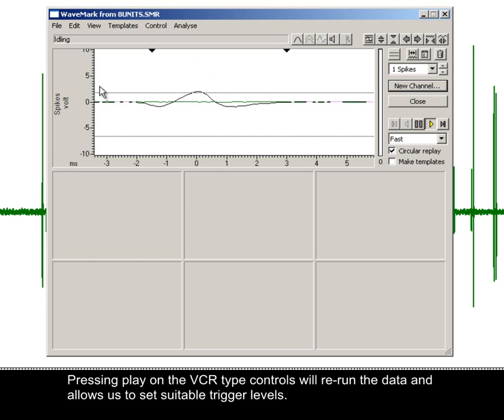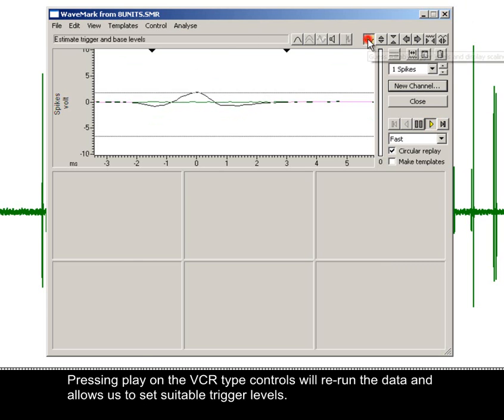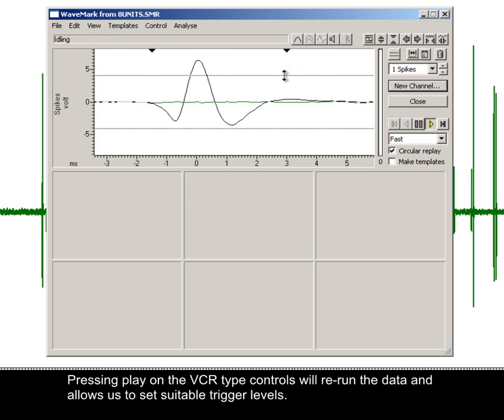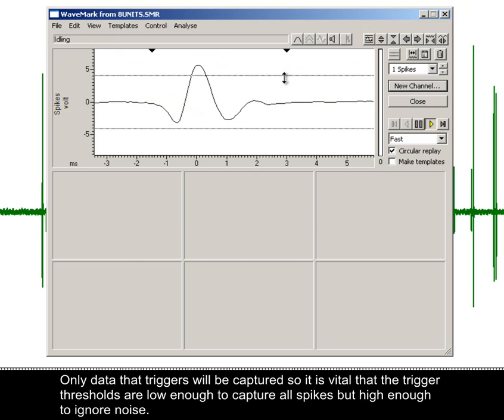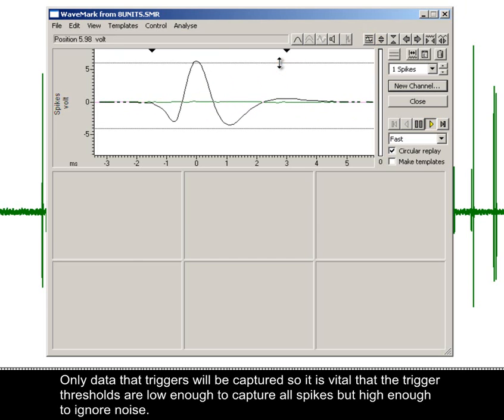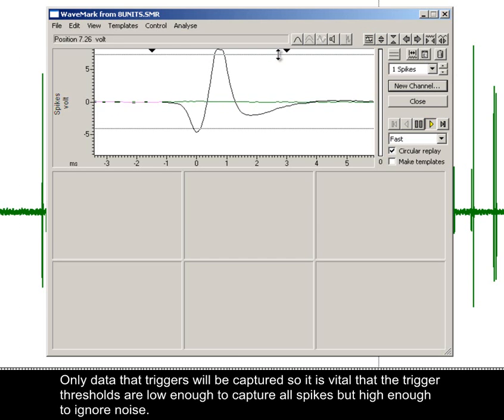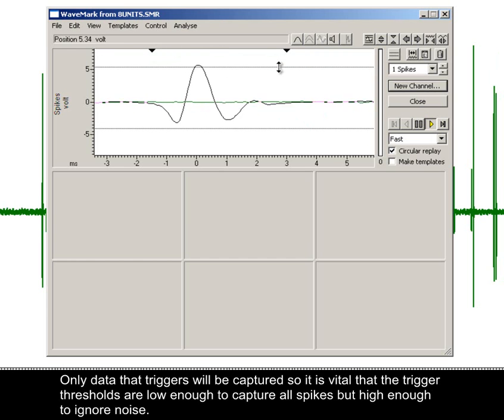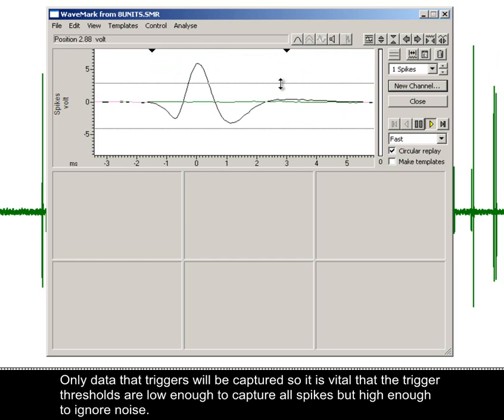Pressing play on the VCR type controls will rerun the data and allow us to set suitable trigger levels. Only data that triggers will be captured, so it's vital that the trigger thresholds are low enough to capture all spikes but high enough to ignore noise.